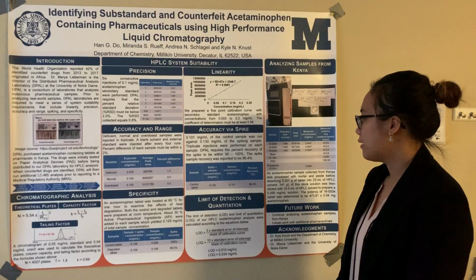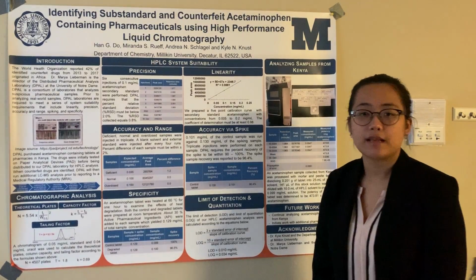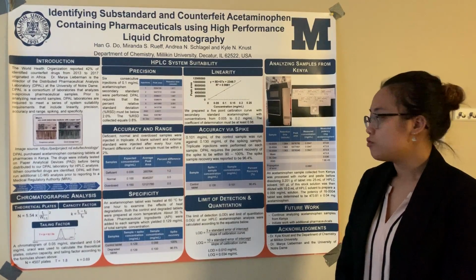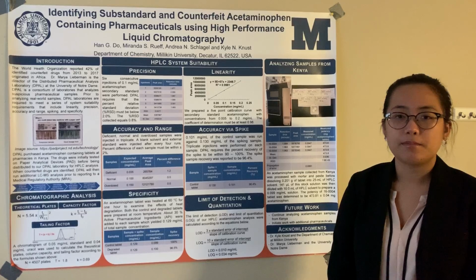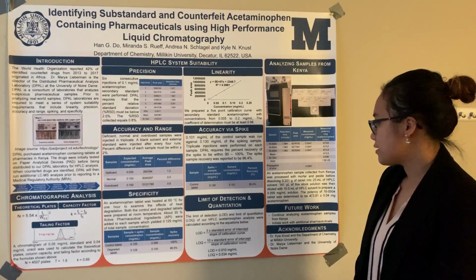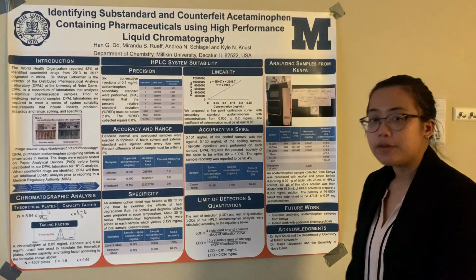Accuracy via spike. 0.101 mg/ml of a control sample was run against 0.13 mg/ml of the spiking sample. Triplicate injections were performed on each sample. DPAL required the percentage of each sample to be between 90 and 100%. I got a percentage for the control tablet of 96.4%.